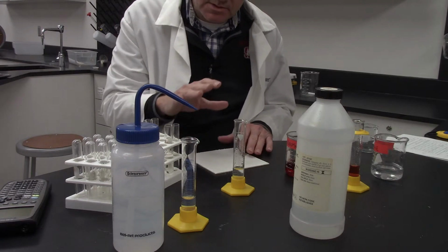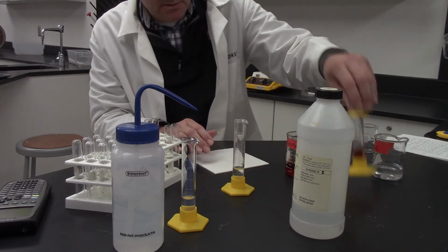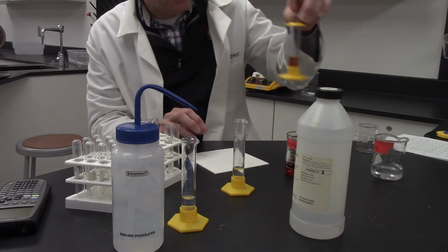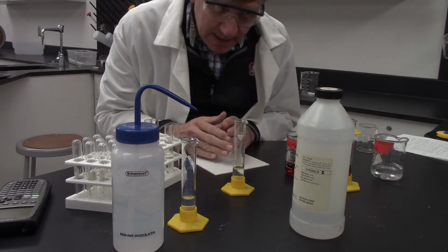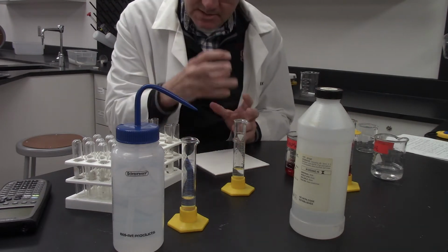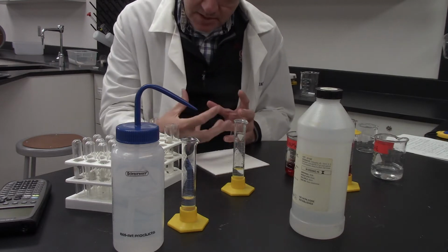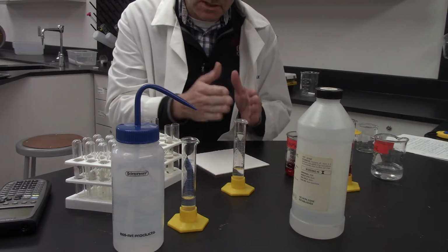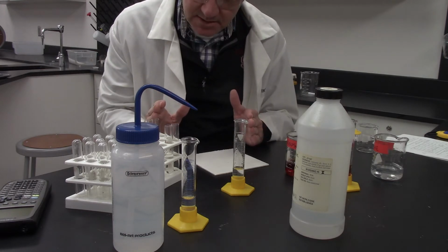In terms of visualizing what's going to take place, we're going to use the fact that iodine has a very distinct brownish color. As you'll see in the reaction when you look at the lab, the iodine gets used up, so that color is going to fade out. Once it goes clear, then we know that the reaction has stopped.